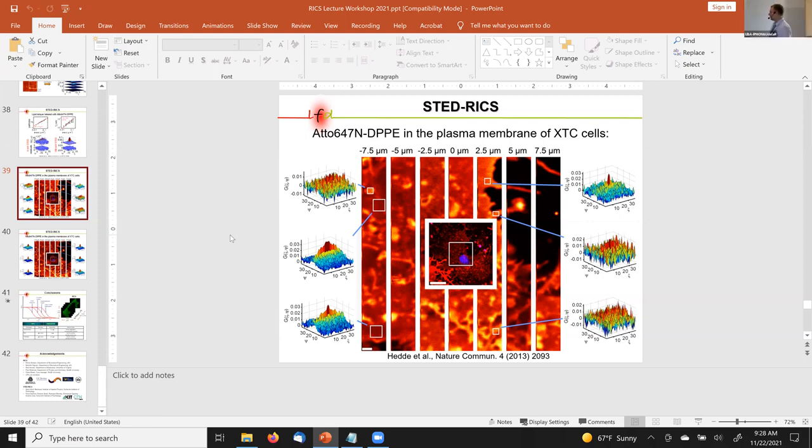Yeah, I hope on Wednesday when Luca Lanzano will talk about super resolution, he may eventually mention FLIM and STED, and how this increases the use of STED, because you don't need to totally bleach, or well, not bleach, basically deplete your donor. You just need to modify a bit the lifetime, and then you can easily localize what is inside the donut or in the perimeter.